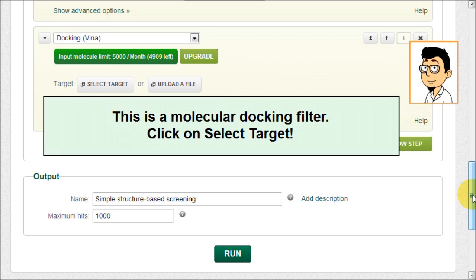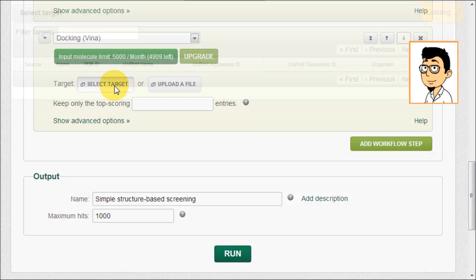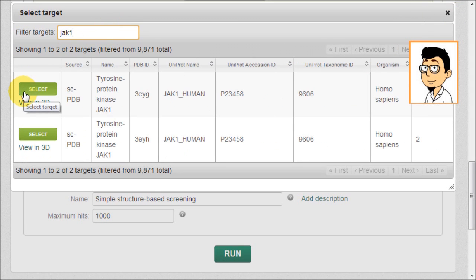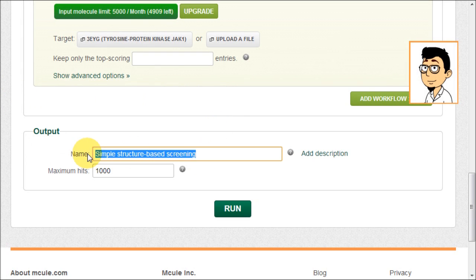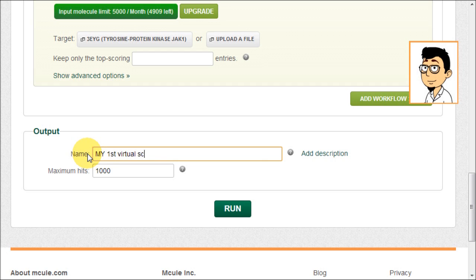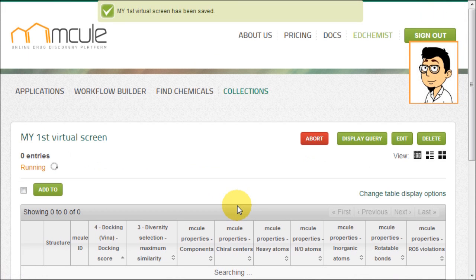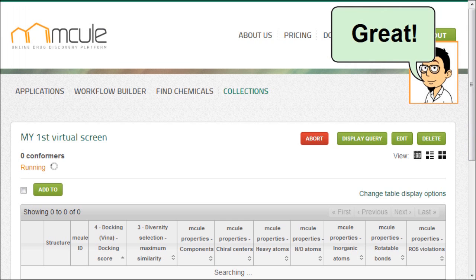This is a molecular docking filter. Click on select target. Your virtual screen is running now. First results will appear soon. Great.